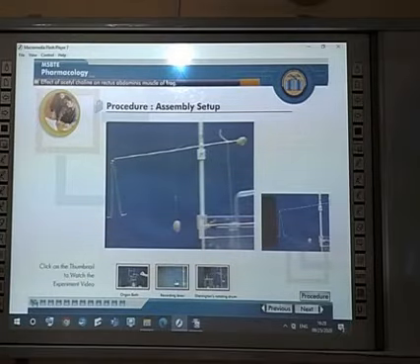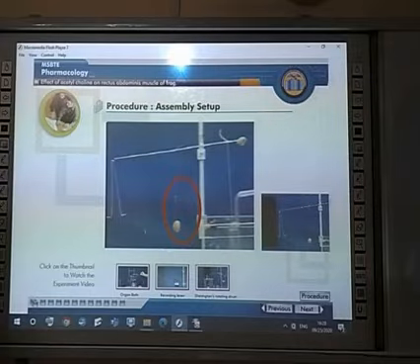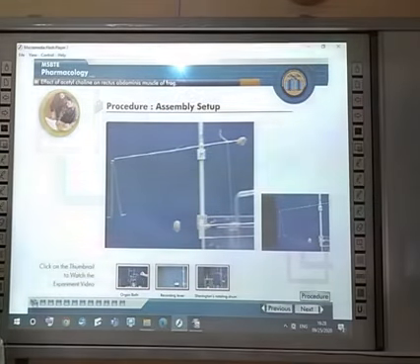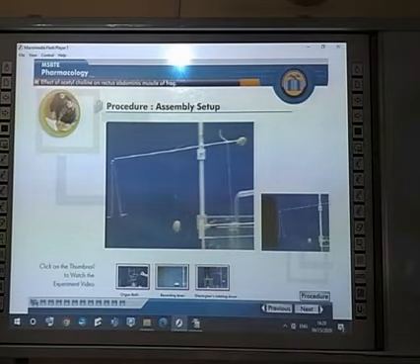For proper recording of responses and for proper relaxation of the muscle preparation after drug effect, application of proper tension or load is required. For example, for frog's rectus abdominis muscle preparation, the tension prescribed is 1 to 5 gram. This tension is applied on the longer arm of the lever. So this is the frontal writing lever setup.